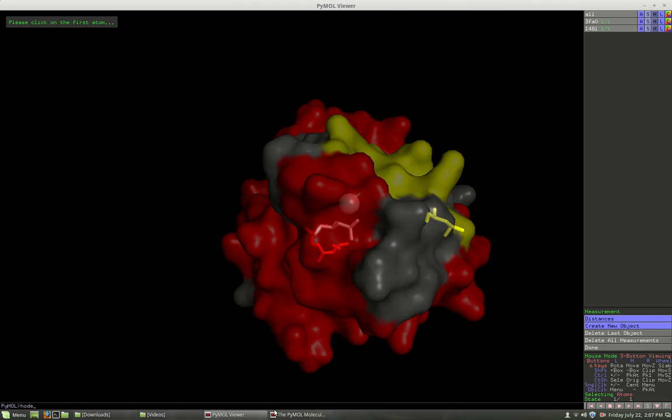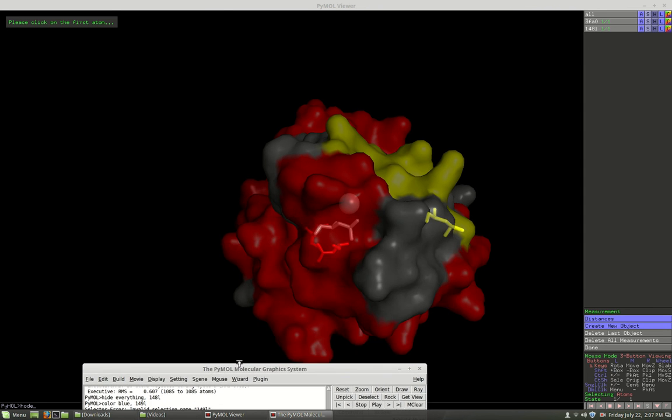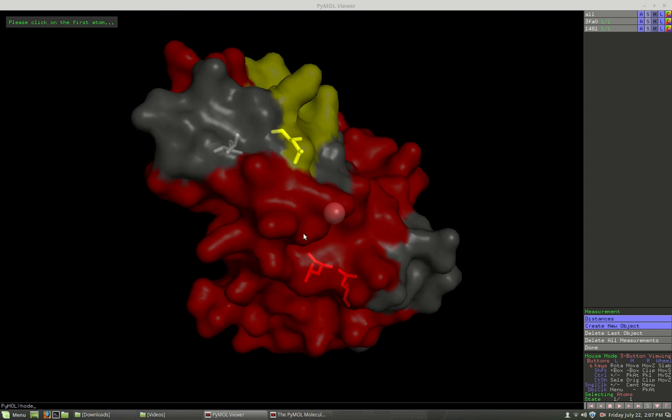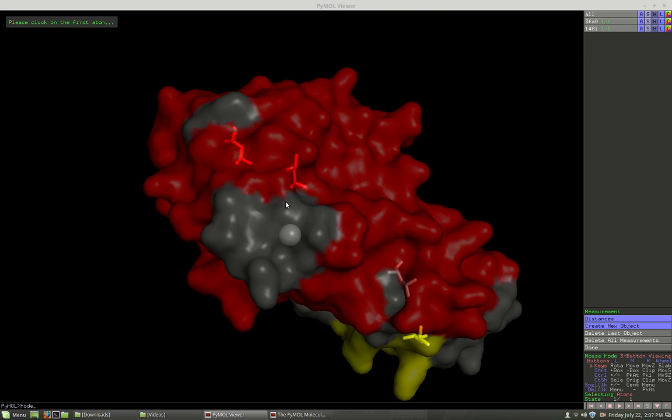I don't know that that did anything. Try that one again. I put 149. There we go. Let's see. What did that do? You still don't see any of it. The other one is covering it up.